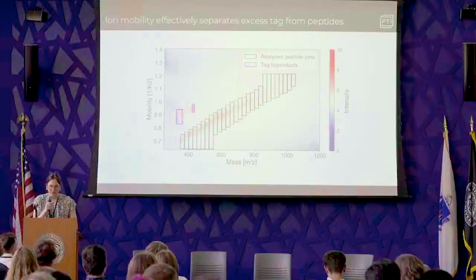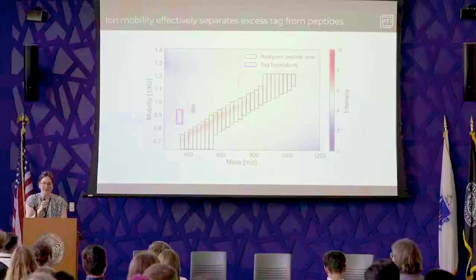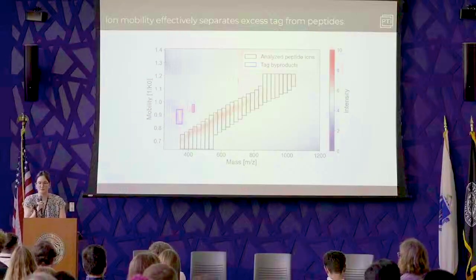So next I'm going to hand over the microphone to Mark, who is going to talk a little bit more about the impact of PSMtag on the spectral quality of the peptides.